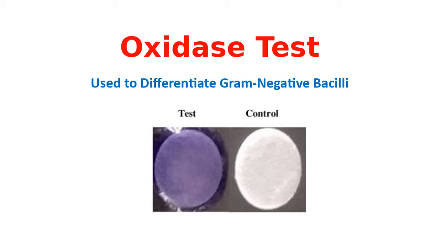We're going to be looking at 3 tests that help to differentiate the enteric bacteria, and that's the oxidase test, the phenylalanine deaminase test, and the decarboxylase test. And then when we come back on Thursday after the exam, for those of you who want to meet with me in lab, we'll go over MacConkey agar, EMB agar, and Hektoen enteric agar. You do not have to. You can choose to skip that day, but you can watch the video.